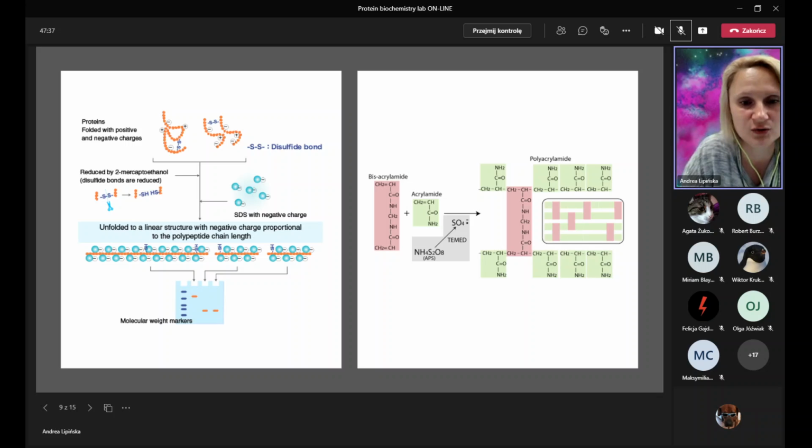This process is sensitive to oxidation. That's why we have to use a layer of water, the simplest way, or isobutanol, because it's not reactive, and also the density is proper. I mean, it's lower than that of the polyacrylamide, so it can just form a layer above the acrylamide and stop the access of oxygen.